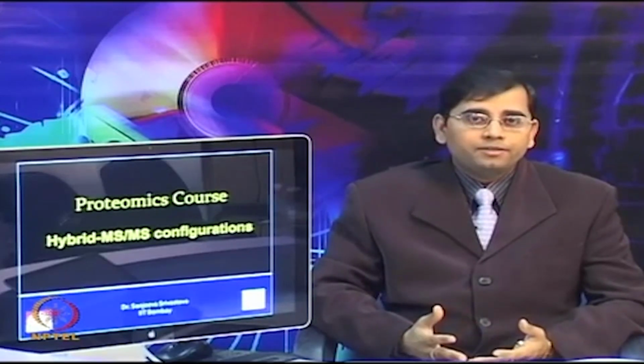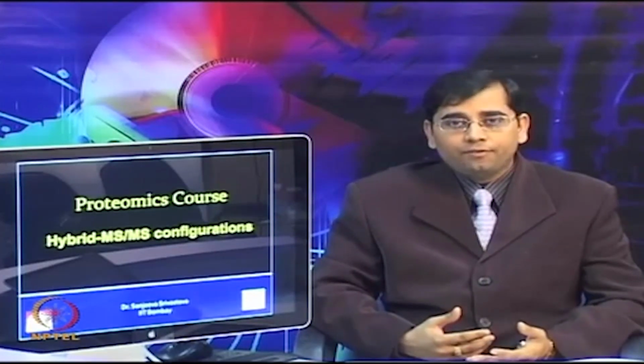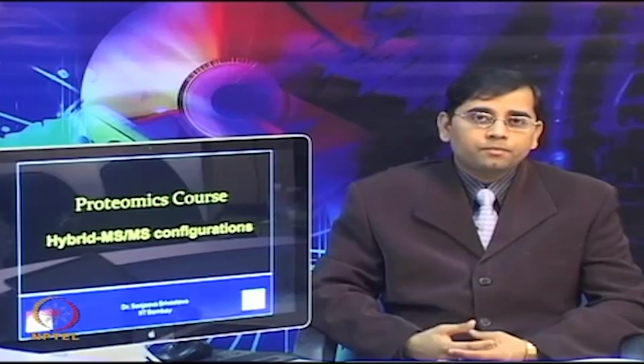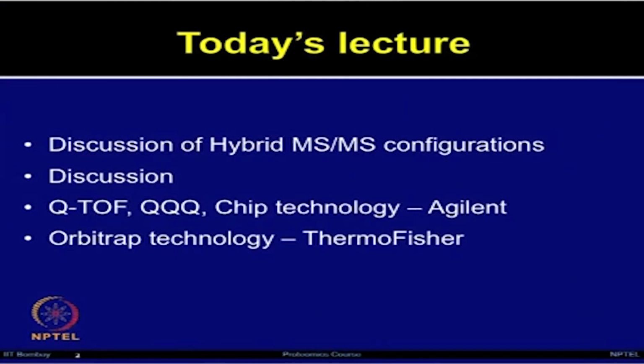There are several new advancements which have happened in this field, and to keep pace with these recent advancements, in today's lecture, I thought to include a discussion on hybrid MS-MS configurations and talk with two leading companies: one, Agilent Technologies, for QTOF and triple quadrupole, as well as the chip technology, and then Thermo Fisher about the Orbitrap technology.